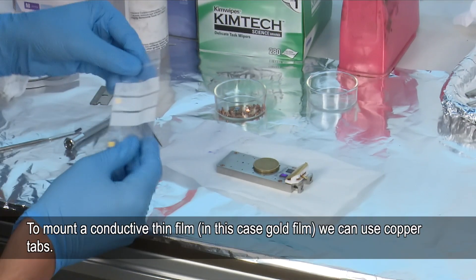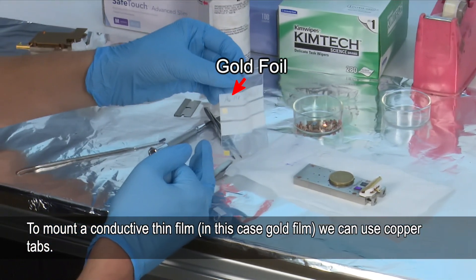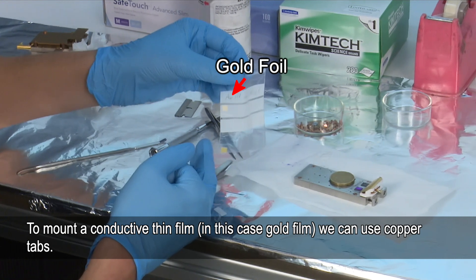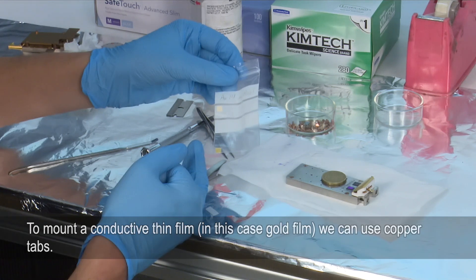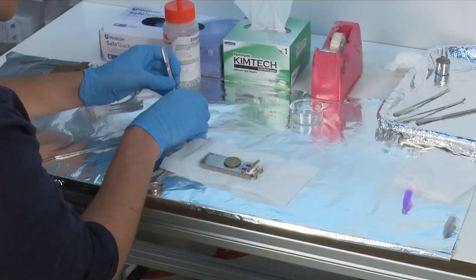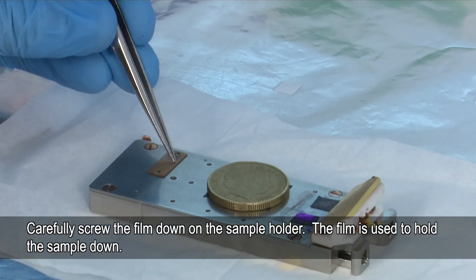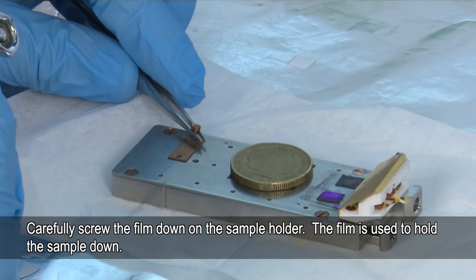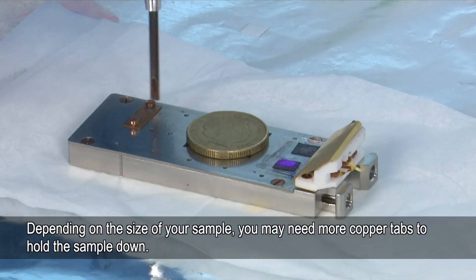Now we're going to prepare a thin film — this is a piece of gold foil. Because gold is conductive, I'm going to use the copper tabs to attach this to the bar. The copper tabs can be found just here next to the sample bar. We just have to screw the plate on and use the bar to hold the sample down. Depending on how large the sample is, you might need to use two copper tabs.